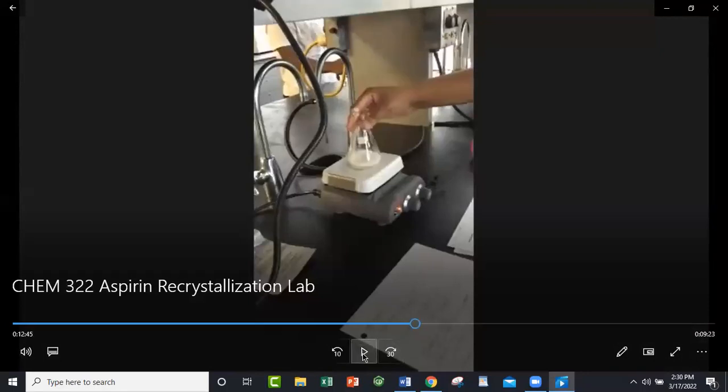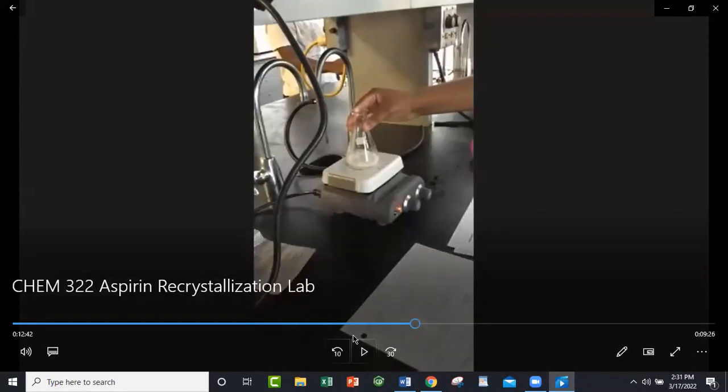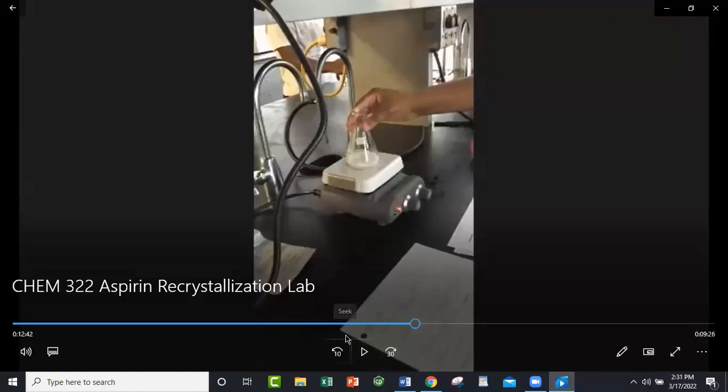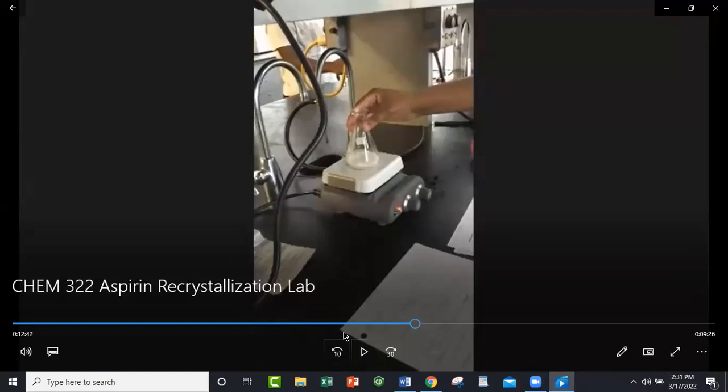Okay, so let me just give you another rule of thumb. When this is being heated, it needs to stay on the heat source. Sometimes if you are heating it and it starts to cool down while you're swirling it, then that crystallization is going to happen immediately, even without cooling it to room temperature or adding water or anything. And you don't want that. Anytime your crystals come out of solution when they're not supposed to, they're going to be less pure than if you allow them to heat and dissolve how they're supposed to. So that's really important: keep it on the heat source like you see it and just swirl it periodically.